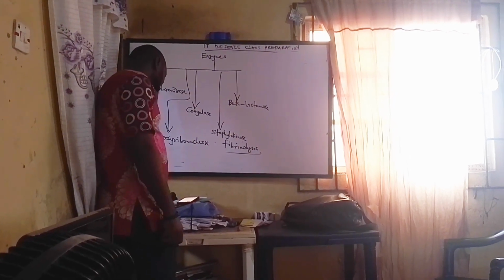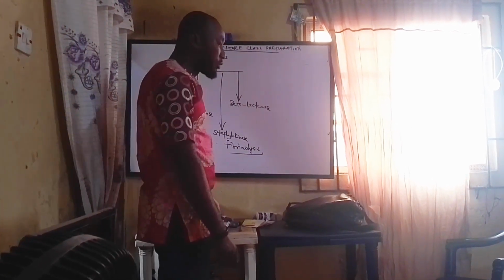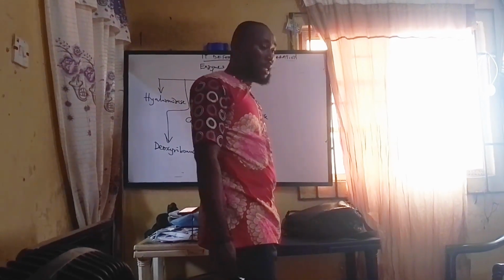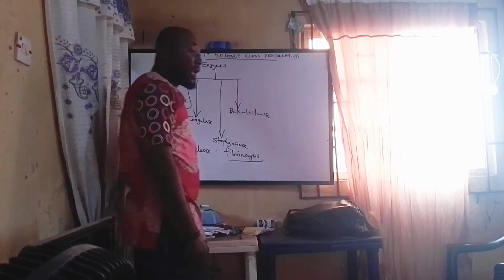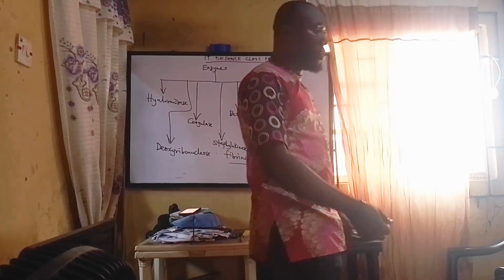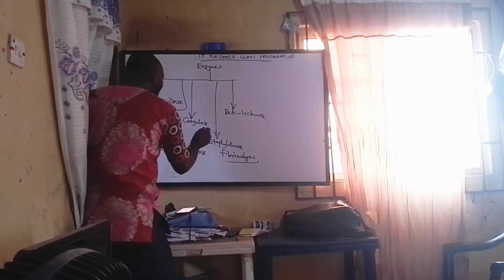So you write: Staph aureus produces coagulase which clots fibrinogen in plasma to form fibrin. That fibrin will enhance the clotting of what? The blood. So when somebody has staphylococcus, if you mix it with a blood sample, the blood will clot. That is the enzyme that uses coagulase.